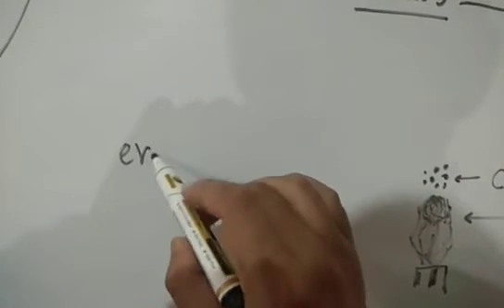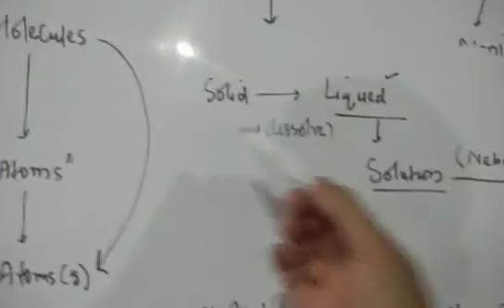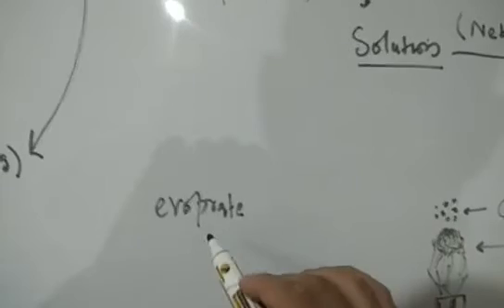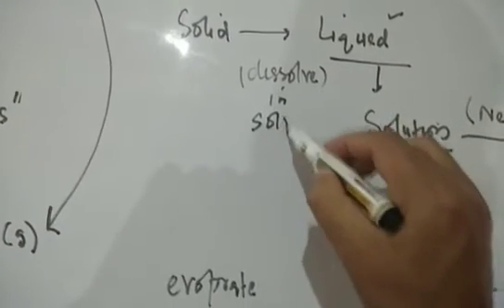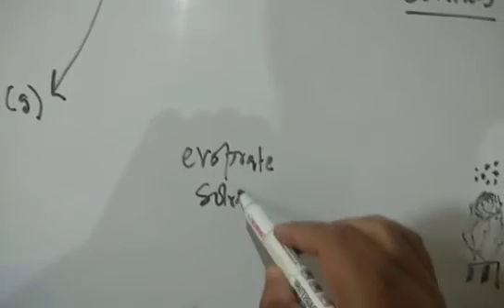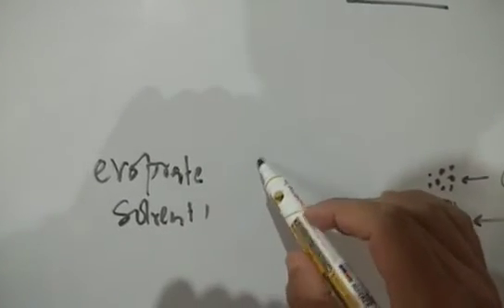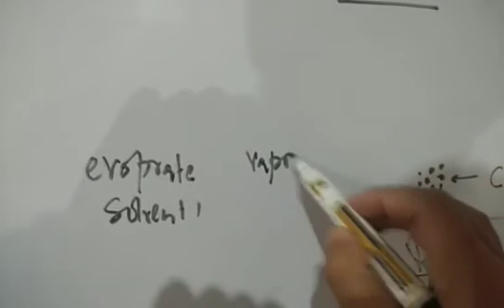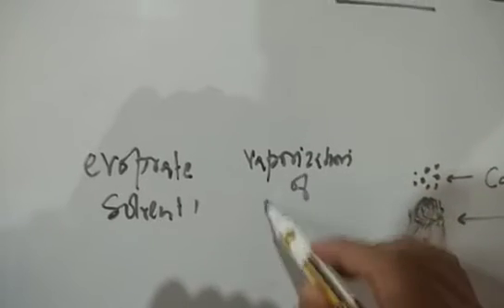सो व्हाट इट विल डू, इट विल एवापोरेट द सॉल्वेंट, जो हमें ज़रूरत नहीं है क्योंकि हमारा जो मेन है दैट सैंपल. तो इसको सॉल्वेंट को निकालना है, सो एवापोरेट द सॉल्वेंट, जो यहाँ सॉल्वेंट था, तो वो बाहर चला जाएगा. उसके बाद जो मॉलिक्यूल था इन द लिक्विड फॉर्म, नाउ दैट आल्सो इवापोरेट, सो दैट वी सी इट इज द वेपराइजेशन, द वेपराइजेशन ऑफ सैंपल.